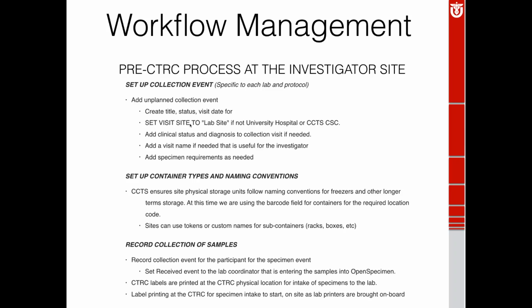One thing about the conventions on the naming for storage locations is that because this is going to be a larger install for the Health Sciences Center, we'd like to have everyone in the system name their top-level containers, like freezers, fridges, that sort of thing, with a location code that the university uses for all of our rooms. So that location code can then be used in reports to essentially show the number of freezers we have across all the buildings.